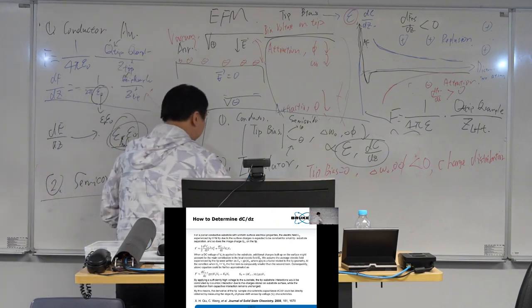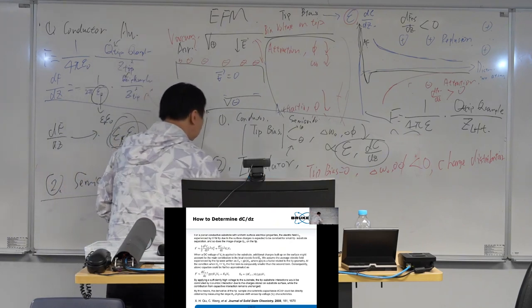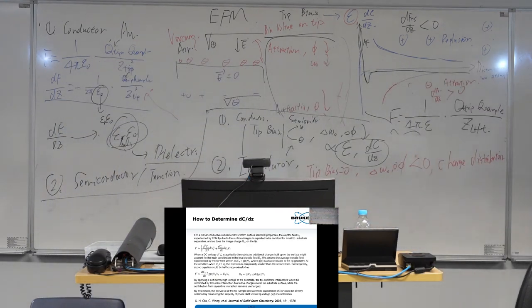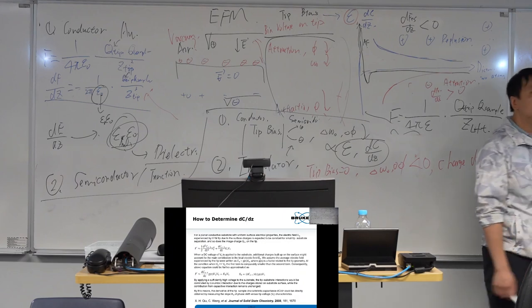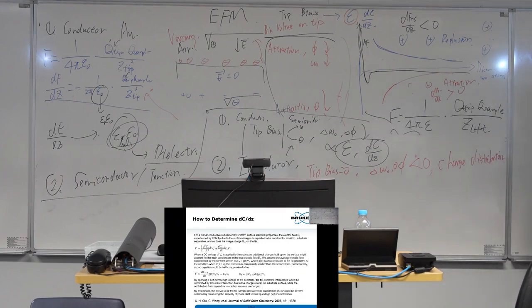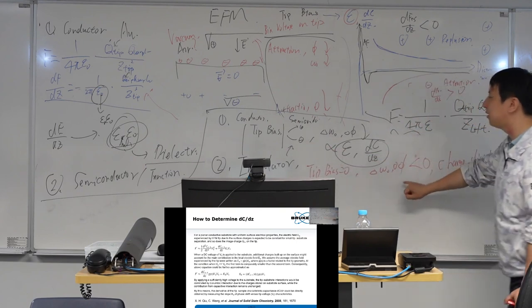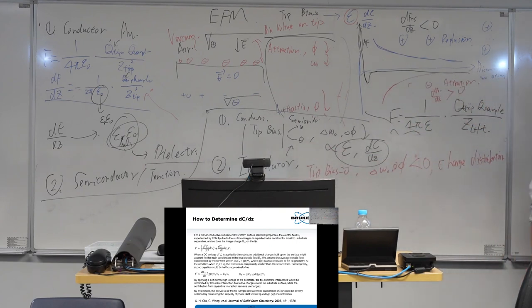The third one, that's this reference wants to tell you. We will have something due to the polarization. This polarization is either due to I apply tip bias or the charge on the sample. It's the same. It will always cause the first term. That's the polarization.